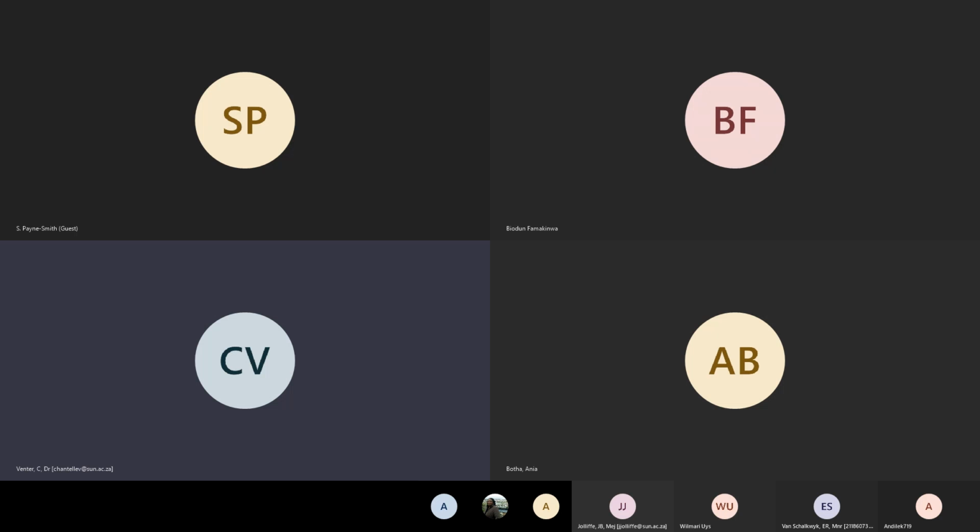So in those cases, sometimes you don't need to stain the cells, because with the phase contrast objectives on the microscope, you will still get a good contrast to view your cells. But because you will only end up with a very thin layer of cells, it will be more tricky to section, because you only have a few micrometers to work with. So I hope I answered your question.